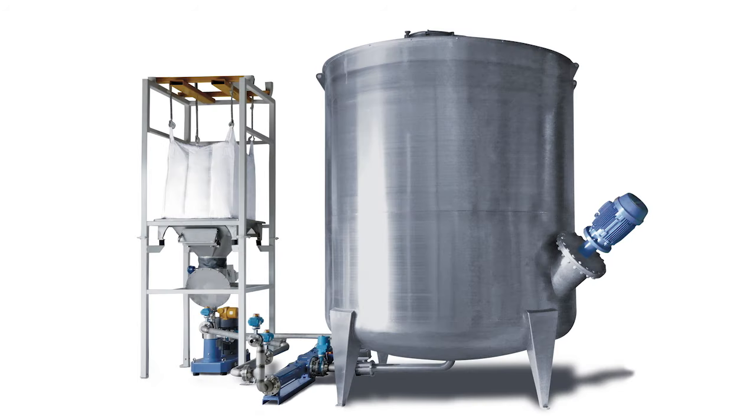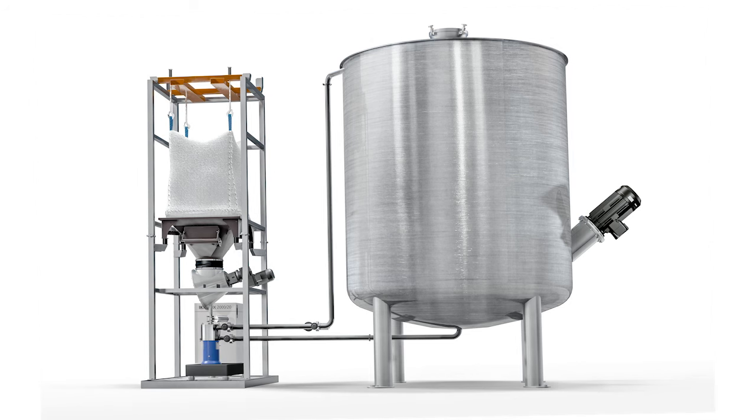The CMX system, developed by IKA, adds solids to liquids in a recirculation process.